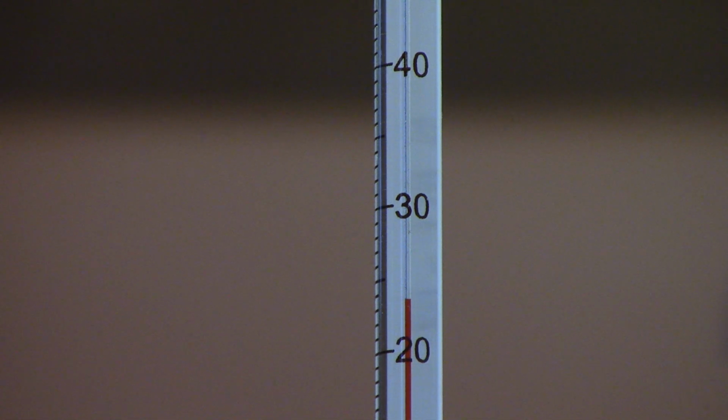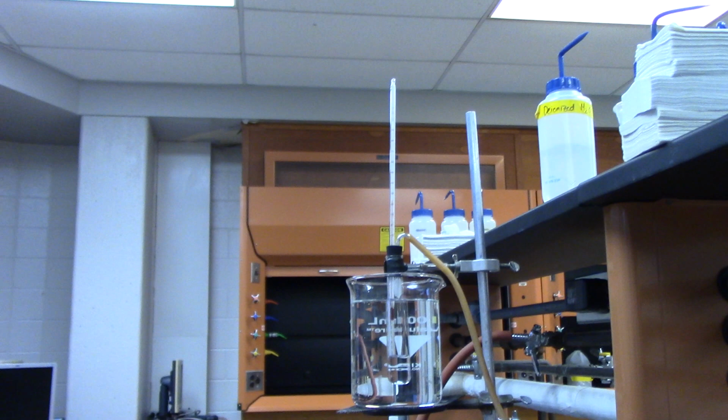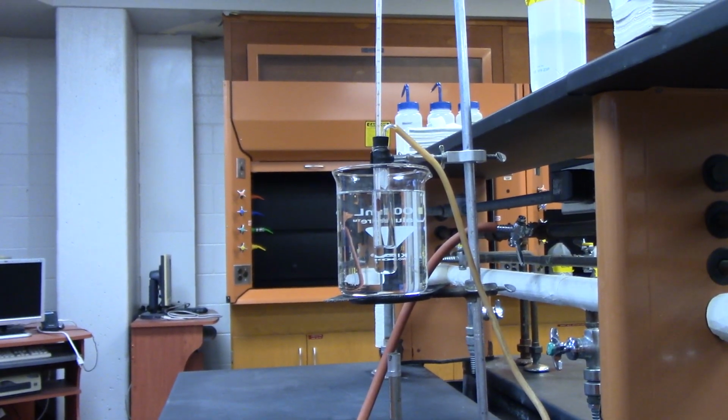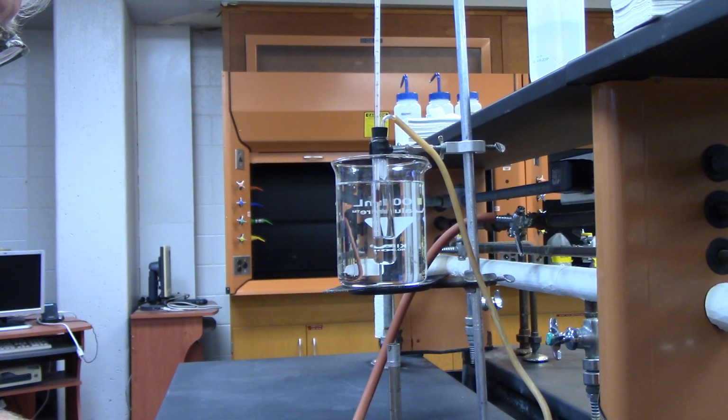So I'm going to start it up, then turn off this video, and then I'll have the last couple minutes of the boiling for us, and I'll record that as well. I'll show you how to start it up, because it's going to take about 15 minutes, and we don't want 15 minutes of dead time on my recording. I'll show you how to get it boiling.